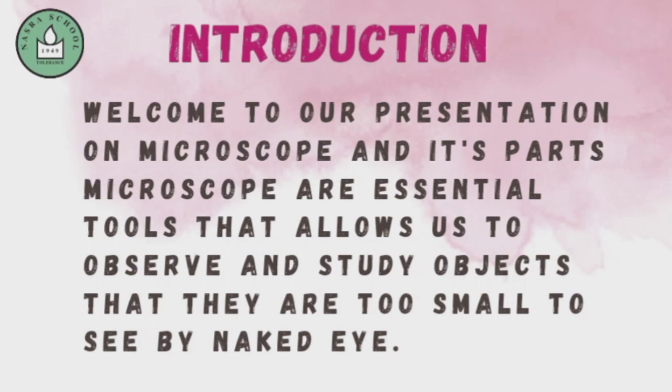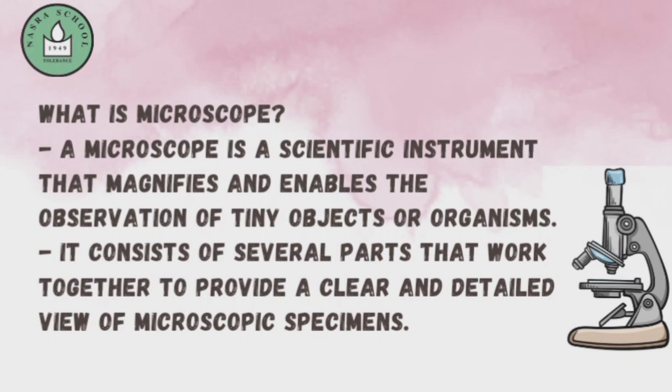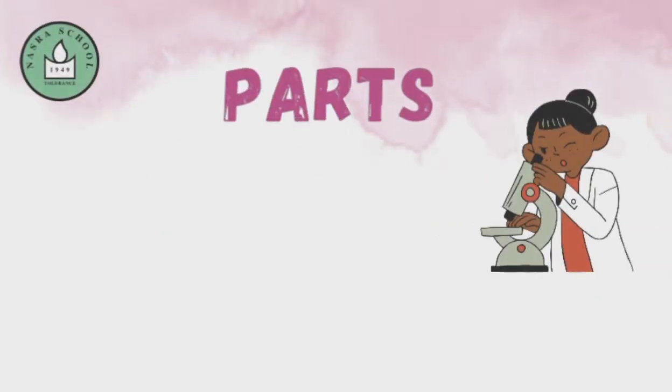Let's move to our next slide. Introduction. Welcome to our presentation on microscope and its parts. Microscopes are an essential tool that allows us to observe and study objects that are too small to see by the naked eye.